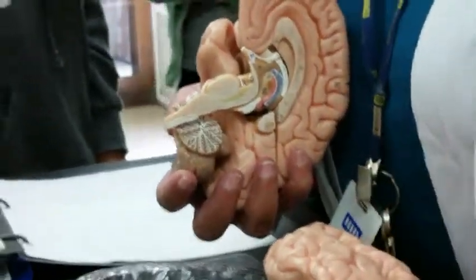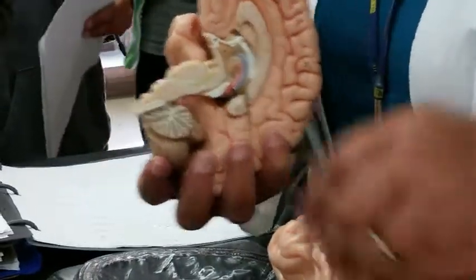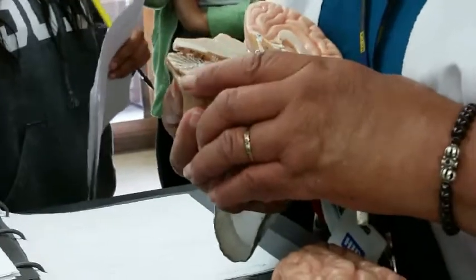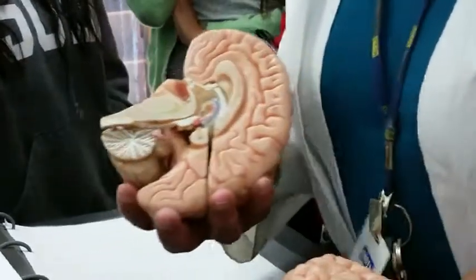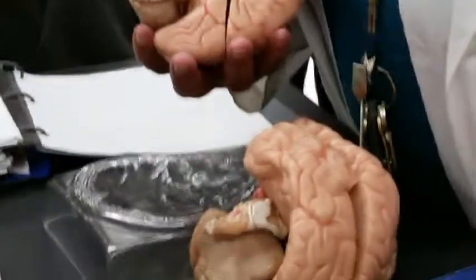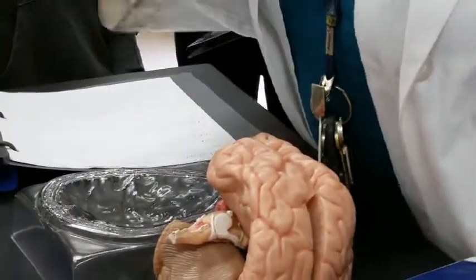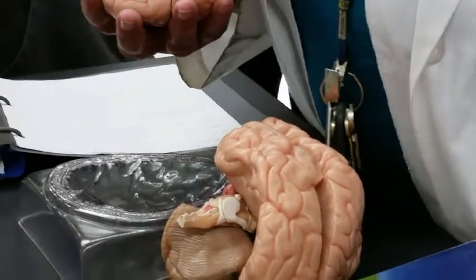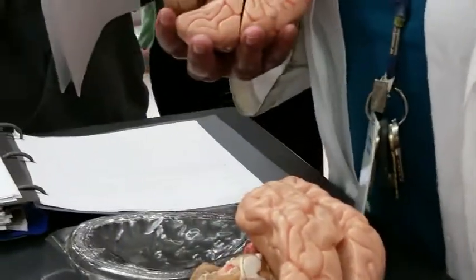So now we're going to go inside of the cerebral hemisphere. Let's take this half and look at the items inside of it. The first thing, I have already pointed out the cerebral hemisphere and the longitudinal fissure. You can take out gray matter and white matter. And now we're talking about the ventricles.